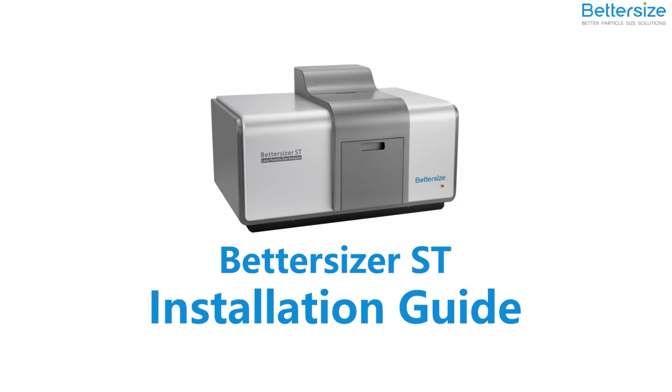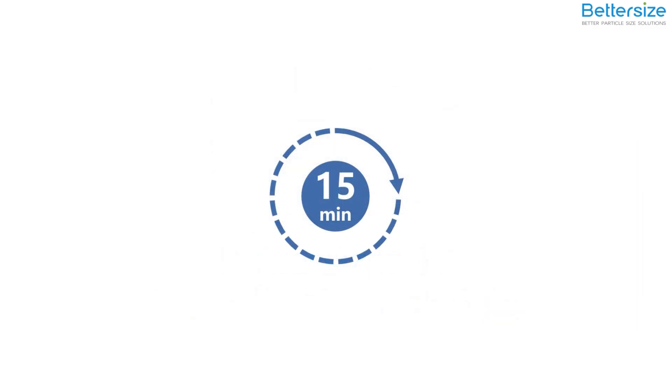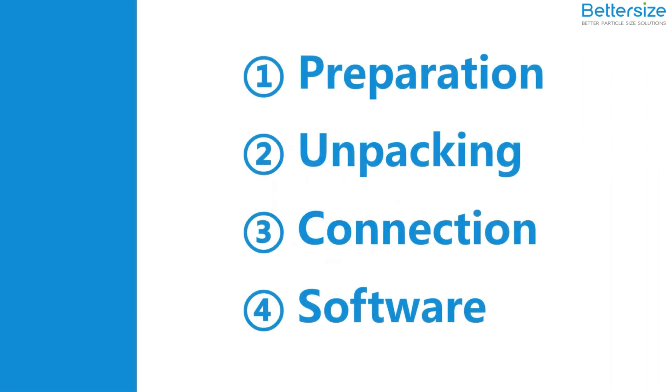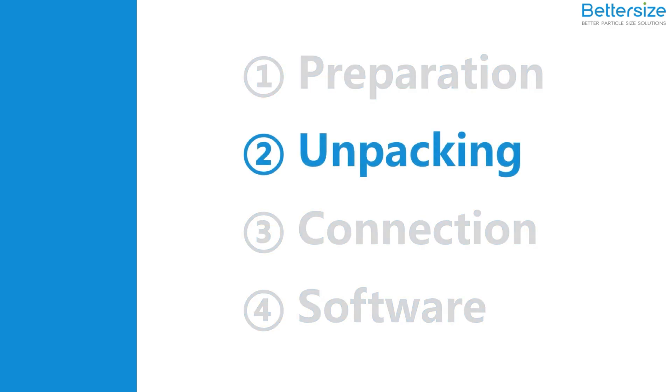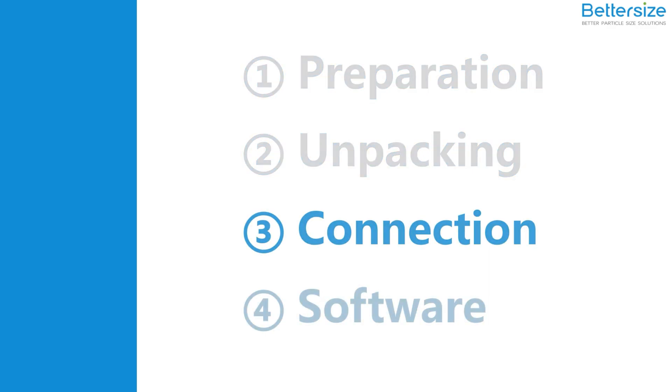In this video, you will learn how to install the Bettersizer ST Laser Diffraction Particle Size Analyzer. In just a few simple steps, you can start your particle exploration journey. Follow our video — it will take about 15 minutes to finish the installation. The installation will be divided into four parts: Preparation, Unpacking, Instrument Connection, and Software Setup. Now, let's start.